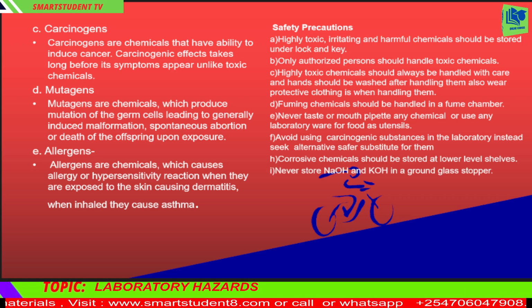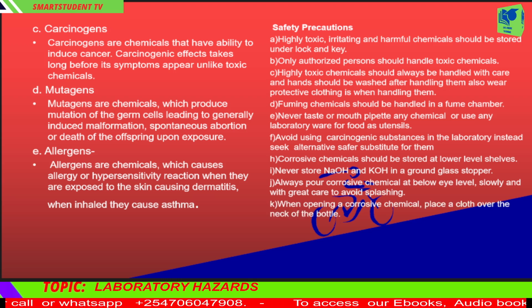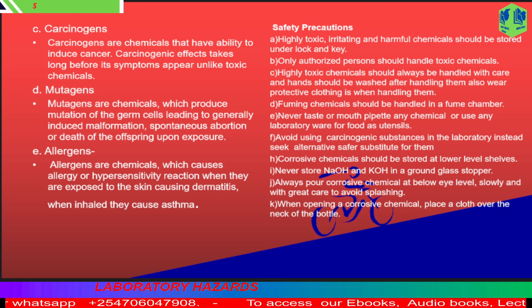I. Never store sodium and potassium hydroxide in a ground glass stopper. J. Always pour corrosive chemicals at or below eye level, slowly and with great care to avoid splashing. K. When opening a corrosive chemical, place a cloth over the neck of the bottle.